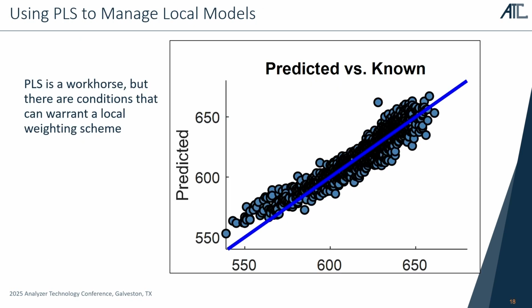method. The other thing that you can do is you can look at the algorithm that's associated with it. And one thing that you will see, and I'll tell you, PLS is kind of the workhorse. You can always rely on PLS. PLS has the advantage that it actually assumes that there's error both in the reference method and in the spectra. If you were to take locally weighted regression or PCR as a mechanism, it makes the assumption that all the errors are in the spectrum, none of the errors in the reference value from the lab. That makes the lab people happy, but no one else.